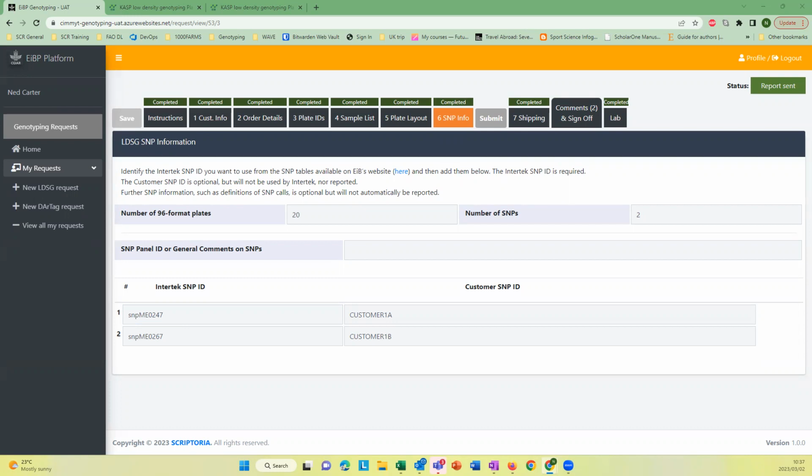Okay, hello, we see Ismail raise too. Yeah, Virendra, go ahead. Is Gajanan here? Yeah, Gajanan. I guess he means that can we upload batch SNP details at a time rather than one SNP at a time? Suppose we have a QC SNP list of 100 SNPs. Can we upload the 100 SNPs list at a time, or do we have to upload it one by one only? Yeah, currently we don't have that feature. Ying, do you want to comment on this?